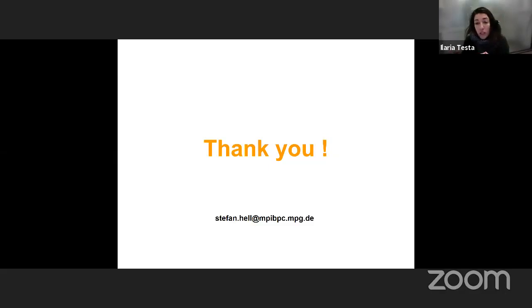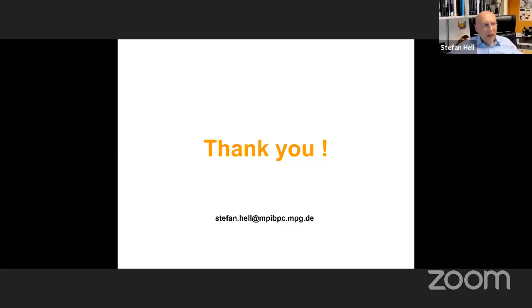Right. In fact, there was a related question in the chat. It was saying, of course, we know that you are trying to get the best technology to get the best data as possible. But the question is, could there be in the future a simplified version of MINFLUX that could still work, especially the electro-optical scanner? But the systems that are available right now are very elaborate, I must say.